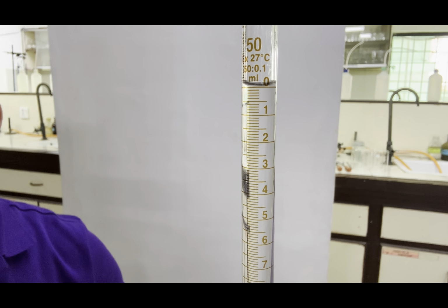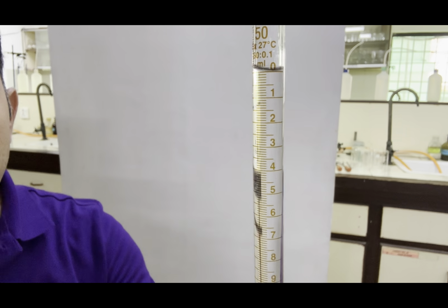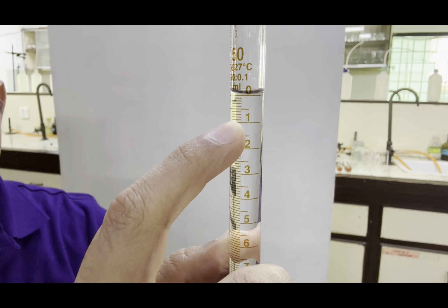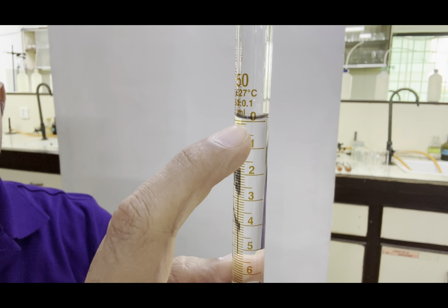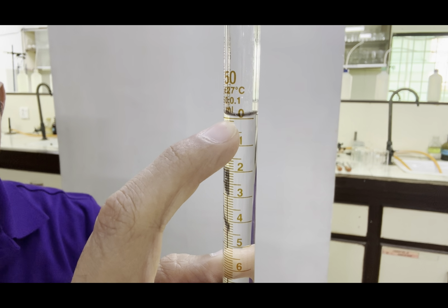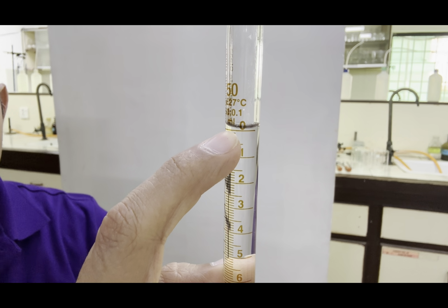One more thing to tell you here is the least count of the burette. From the graduations given it can be seen that it is 0.1, because this is 1 cm cube, 0 to 1, and we have 10 readings here. It means each graduation is 0.1. So if each graduation is 0.1, we will measure its reading up to 0.05, which is in between these two.